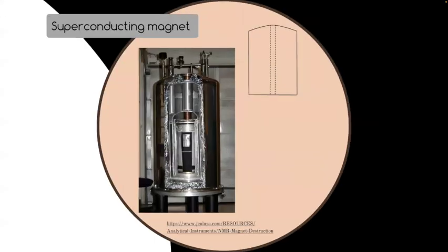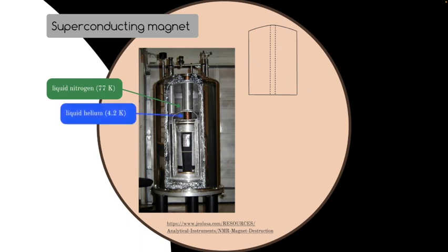It turns out that an NMR magnet is very similar to that copper wire wound around a nail. A little bit more complicated in practice and implementation, but the same general principle. In NMR, we have these big cans that are really thermoses, called cryostats, that are designed to hold, in this case, liquid nitrogen on the outside, in this nice cutaway that I found at JEOL. Liquid nitrogen is at 77 degrees Kelvin. It keeps liquid helium on the inside cold at 4.2 degrees Kelvin.